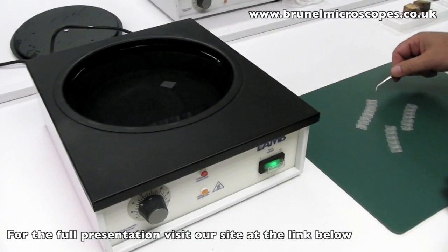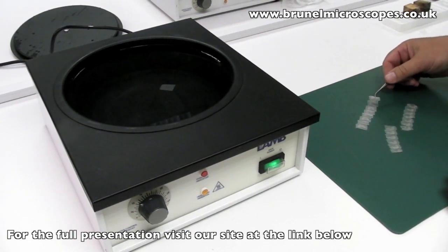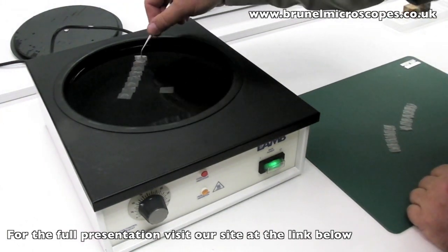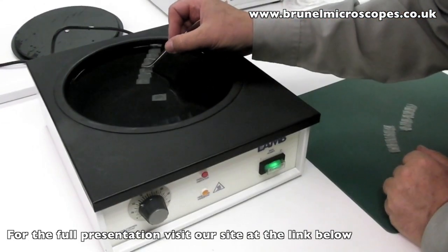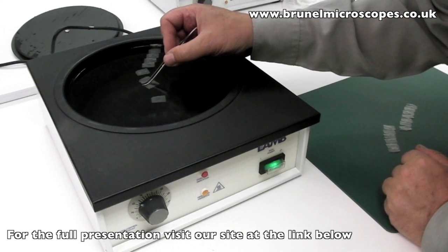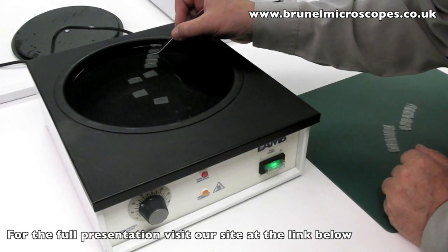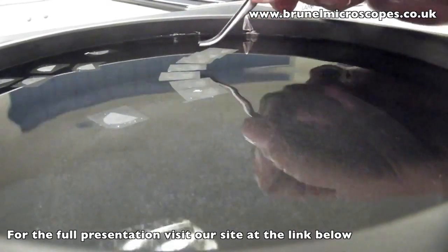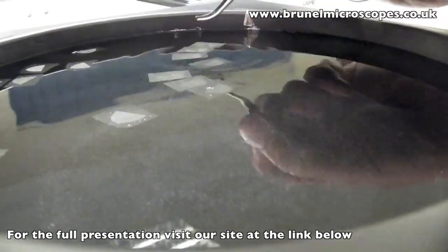A bowl of warm tap water makes a perfectly good floating-out bath, providing it has a good surface area and enough depth for a microscope slide to be held vertically. Using a pair of curved-ended forceps that must be kept clean at all times, select a short ribbon of sections by one end. Sweep them across the surface of the water bath so that the free end catches the water, and then effectively lay the ribbon on the water, using the side of the bath to disconnect the ribbon from the forceps if necessary.